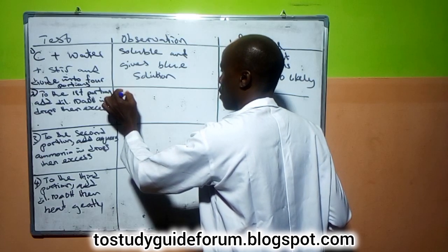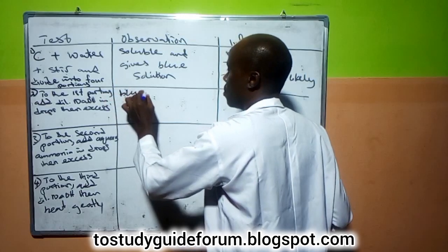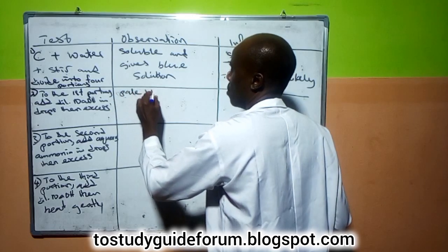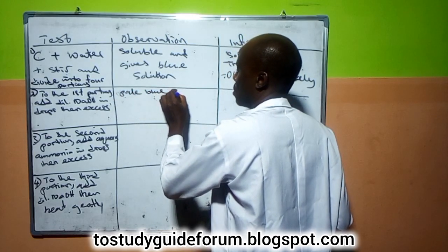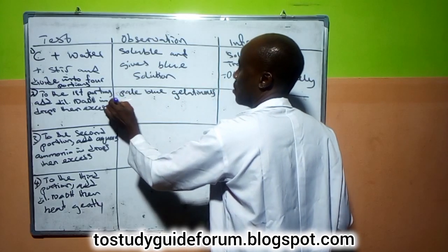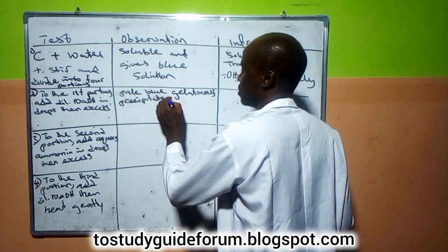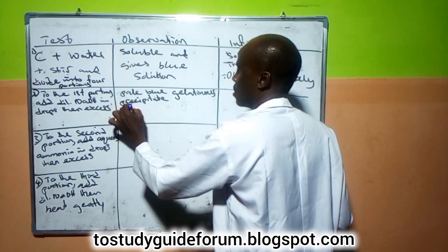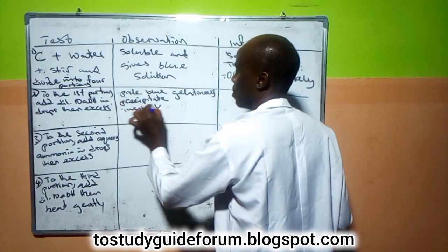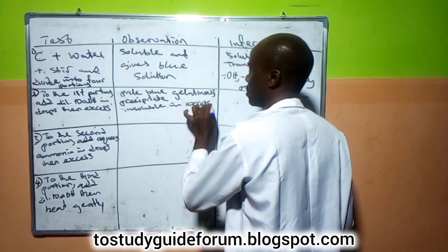blue or pale blue. Let's say blue, maybe let me use that. Pale blue gelatinous precipitate, insoluble in excess.